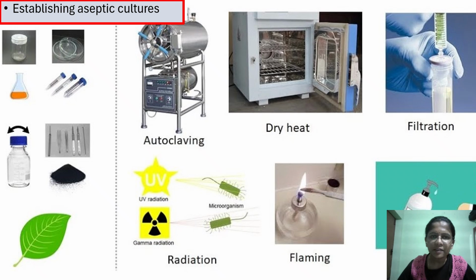Even here we can sterilize all the glass vials we are using. Even petri plates, before usage or before the start of any preparation of media, we can sterilize. Even after preparation of the media also, the media can be sterilized here. So that is the one thing.